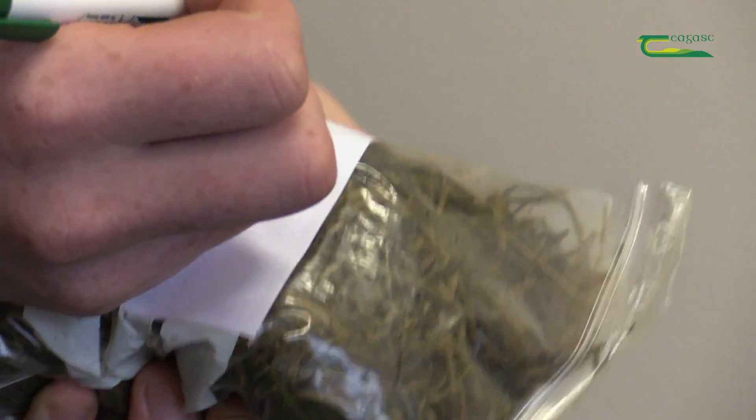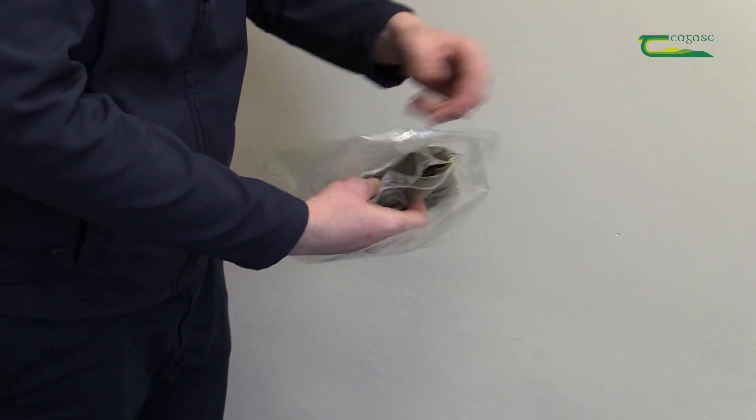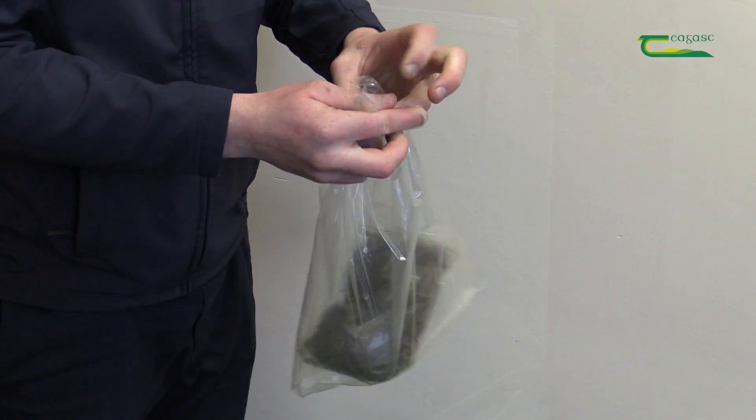Label the bag with details of silage type, date of cutting, and farmer details. It is good practice to place the bag within a second bag to prevent air contamination during the transport period.